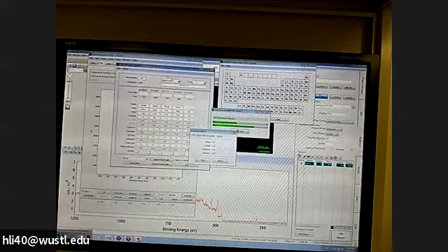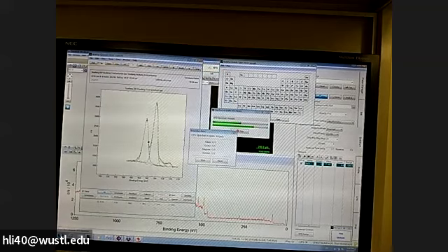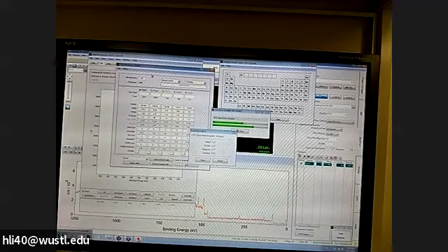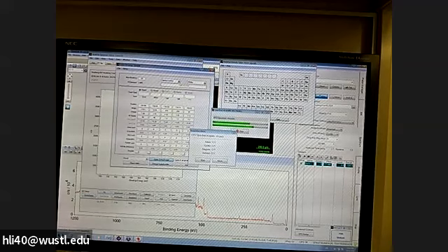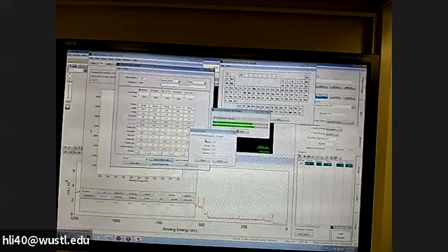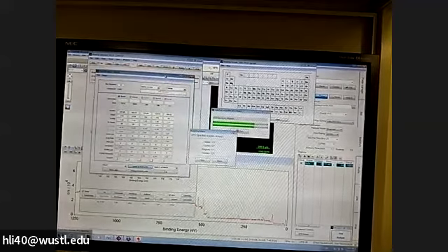What you can do sometimes is repeat this process, you say, okay, fit again. So you may see some change. Okay, you say apply default limits and fit again. So you will be able to see a little bit better fitting. Still no change, but sometimes you just need to try. All right, so this is how we do fitting.